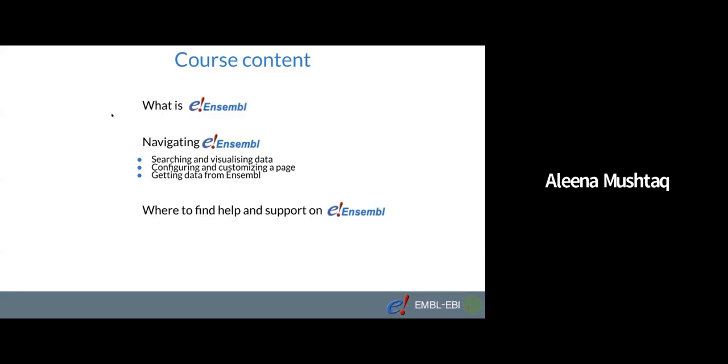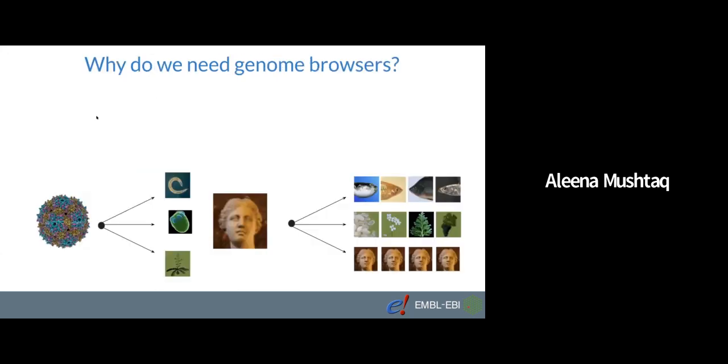So for this webinar, we're going to cover what Ensembl is, how to browse and navigate the Ensembl website, how to search and visualize data, customize a page, and the different types of data that is available on the browser. And then finally, and the most important one, we're also going to talk about where you can find help and support on Ensembl.